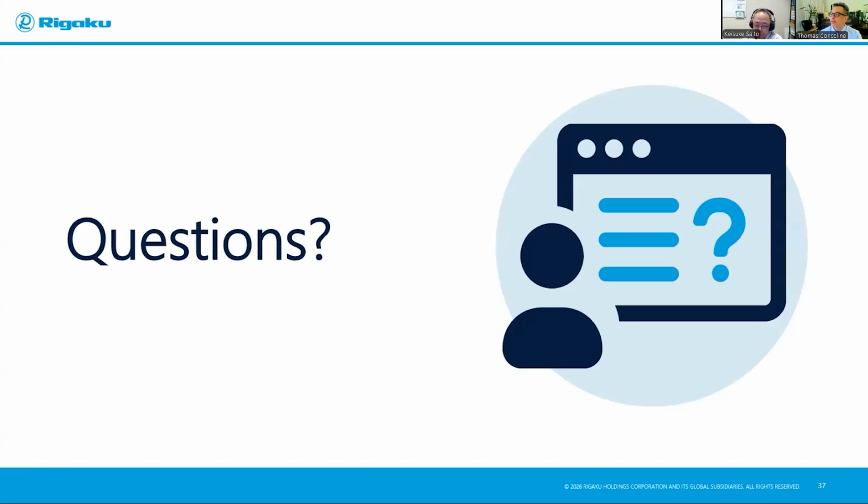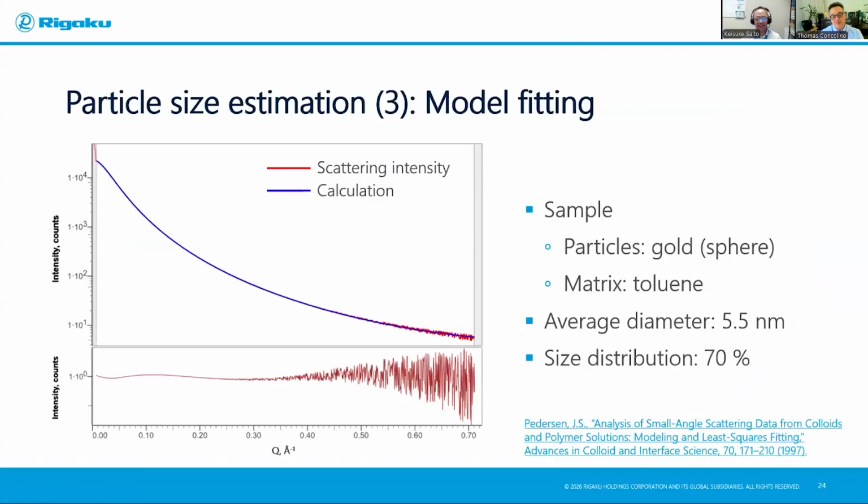The next one is also related: can SmartLab Studio 2 handle the reduction and fitting of SAXS profiles? And then the next question, again all software, is can you only determine the particle size distribution in materials that are crystalline? And the second part of that question was, would it be possible to determine the size distribution of voids rather than the particles? These are all part of the data processing, so I put them into a single subject. You can answer them individually.